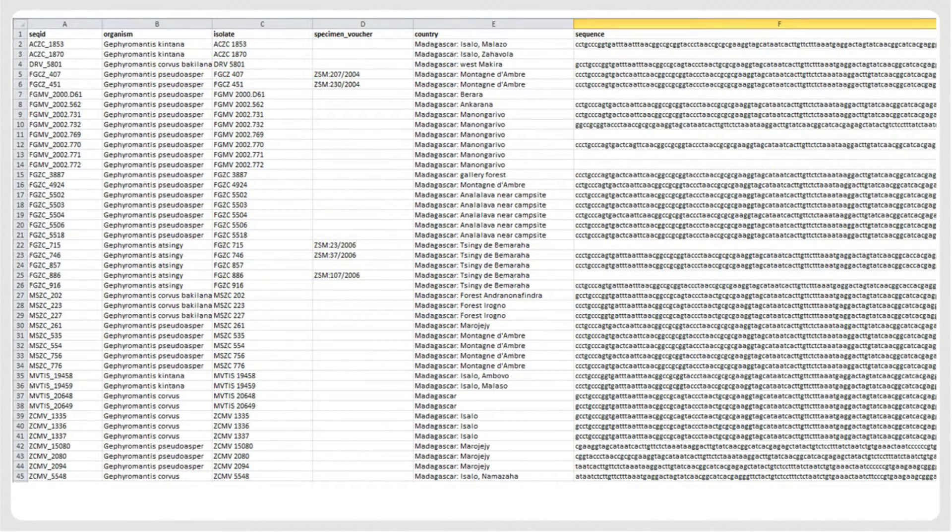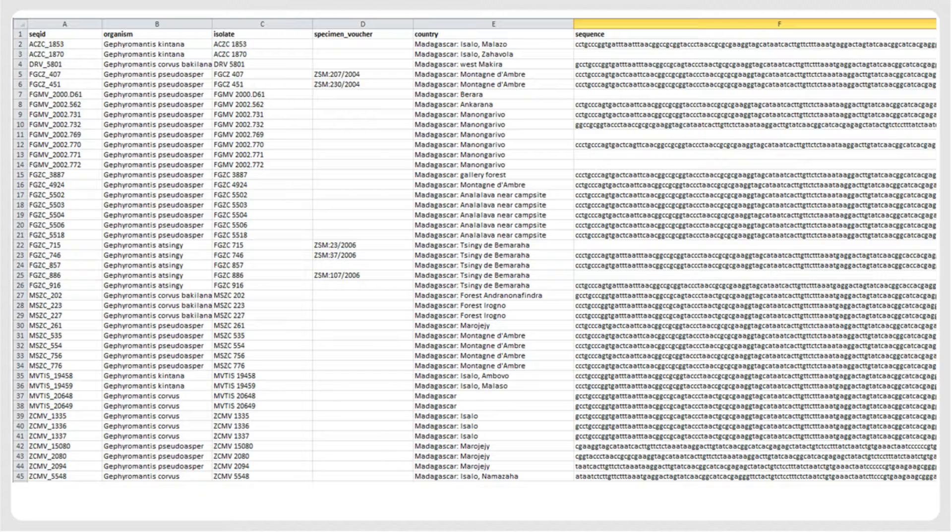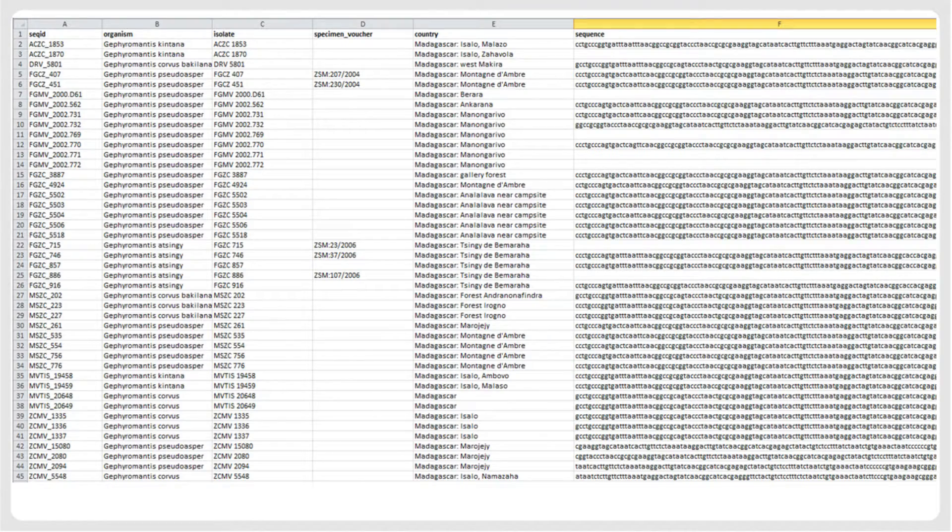When preparing the GenBank formatted FASTA file, remove all previously published sequences that may have been included in your table. The column containing the sequence should be named Sequence. The first column should be a unique identifier for each sequence called seqid, which serves to identify the sequence during the submission process. Although there are ways to submit sequences of different markers simultaneously, we highly recommend including only sequences of one marker in one submission, as we will do in this tutorial. For sequences of other markers, the process will then need to be repeated.